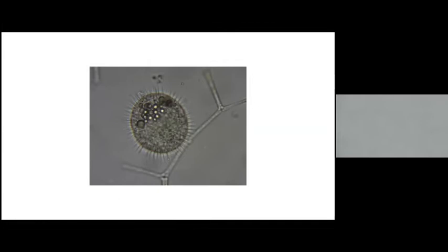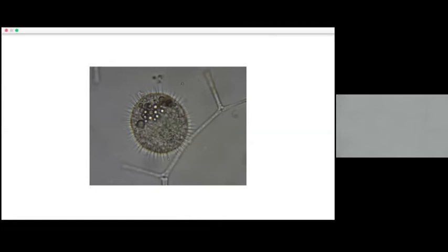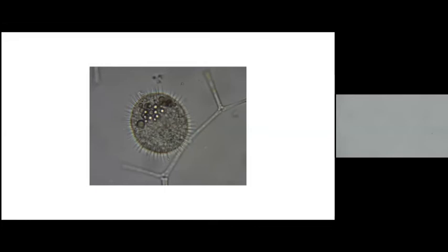Ooh, maybe it's a cell. That's a cool guess. What made you think that it might be a cell? Was it something about the shape or the color maybe? Or maybe the size? Observations. Oh, Nippon thinks it could be a flower. Cool. I like that idea. Yeah. So, ooh. Does anyone want to say anything about the shape and the color?